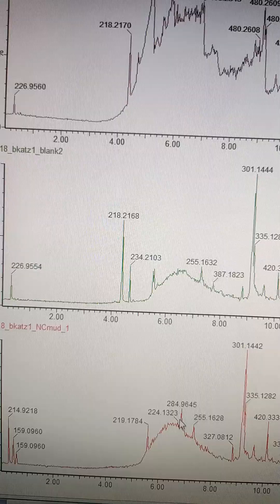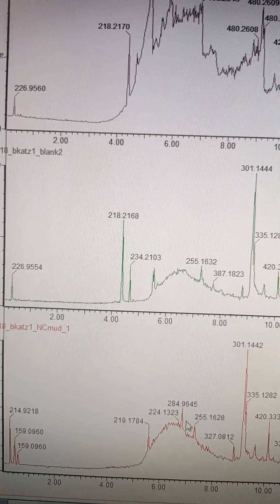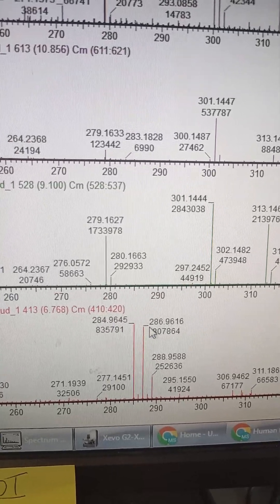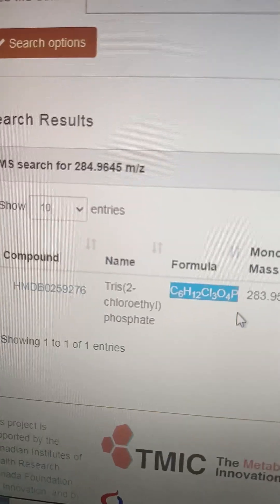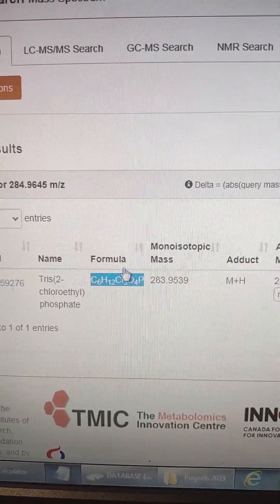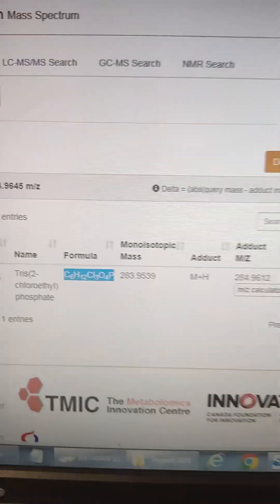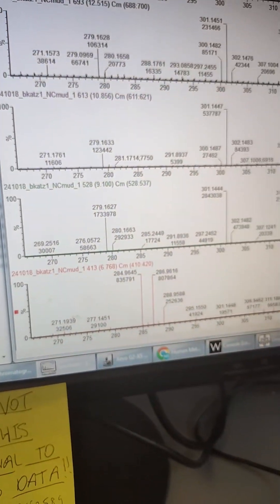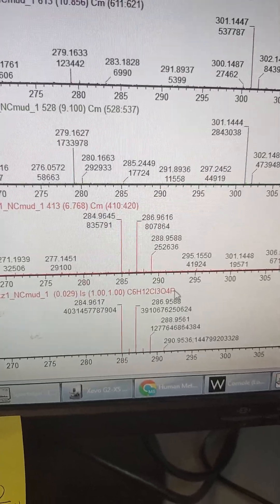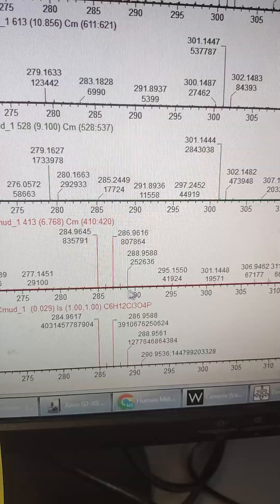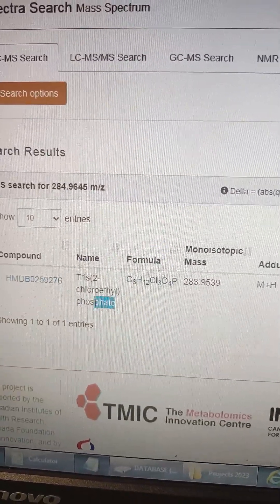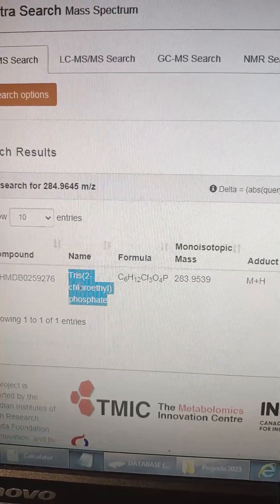284 mass. See how it's skipping isotopes? 284 to 286. That's definitely halogenated. That's a 284 that has a strange isotope pattern. It's matching somebody with three chlorides. That's halogen. That could be the right pattern. So we're going to copy that pattern and put it on an isotope model here to match. There's the isotope pattern from the hit. There's the molecule we're finding at 284. So I'm pretty confident. We got ourselves Tris Chloroethyl Phosphate.